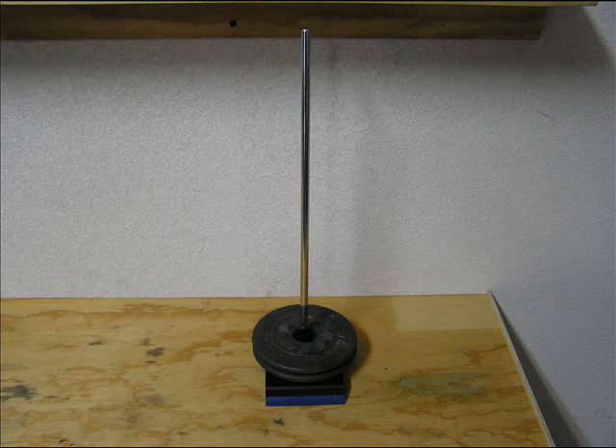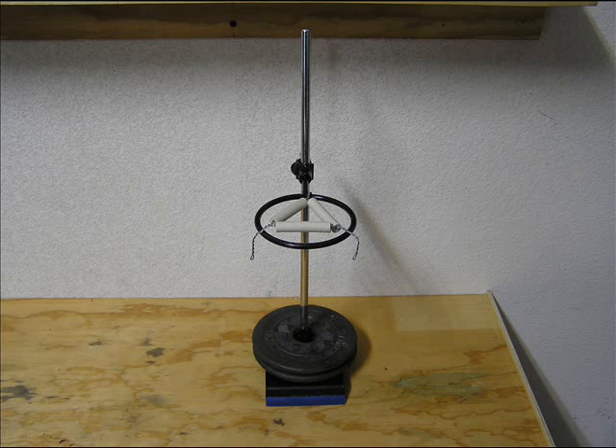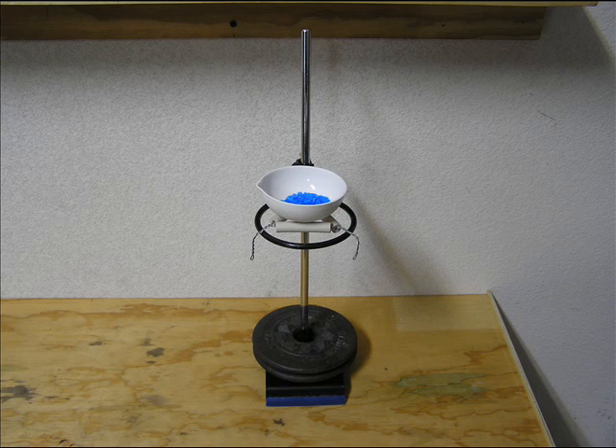Let's set up our apparatus. First, grab a sturdy stand. Then, attach a ring to the stand. Next, place a clay triangle on top of the ring. And finally, place the crucible with copper sulfate on the clay triangle.